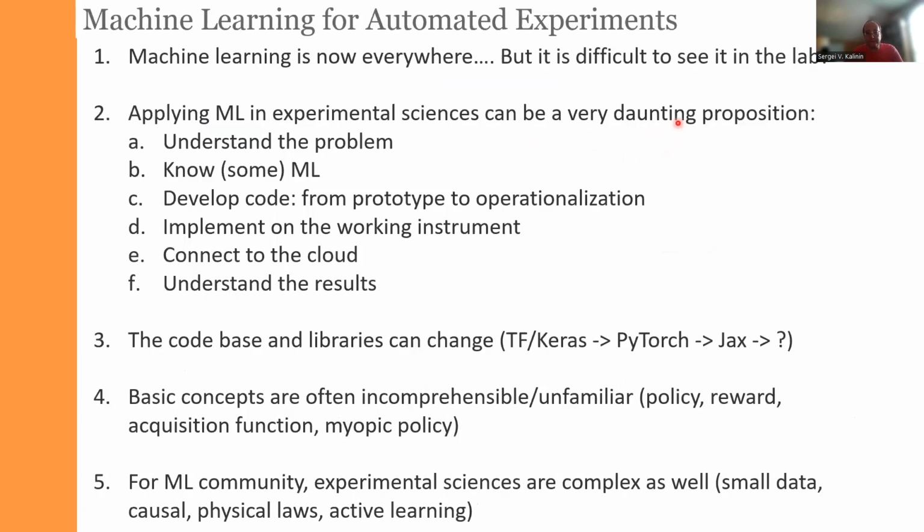So this being said, let's go back a little bit to the original lecture and see how this process can be started. As I mentioned a year ago, you need to somehow get the controls to your microscope. By now, it looks like industry is going to give us the API that allows us to deploy the code on the real world tools. So the question becomes, what do we need to do to implement automated microscopy? Again, we need to understand the problem. Understanding of the problem is something that a domain scientist should do.